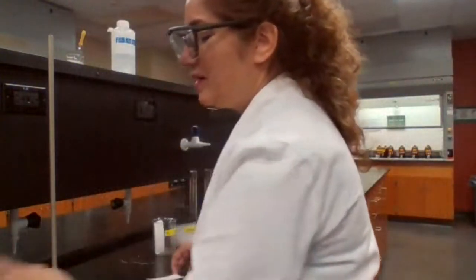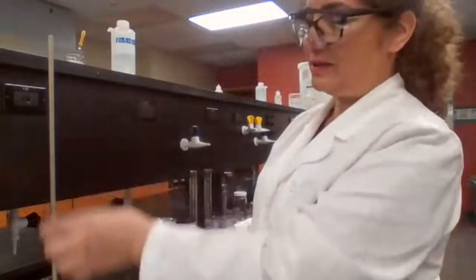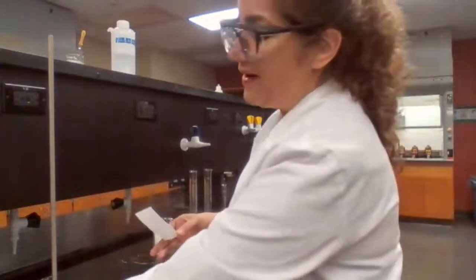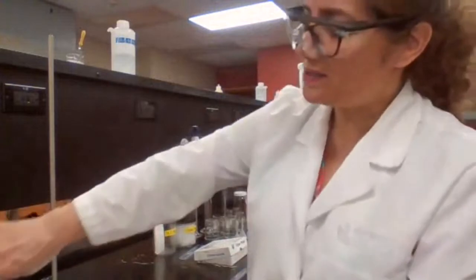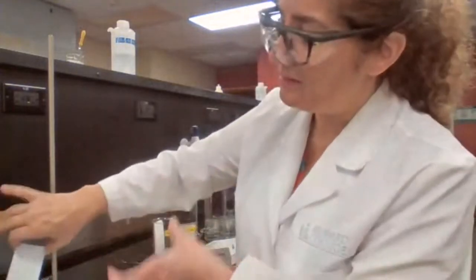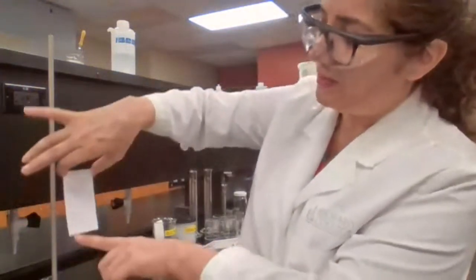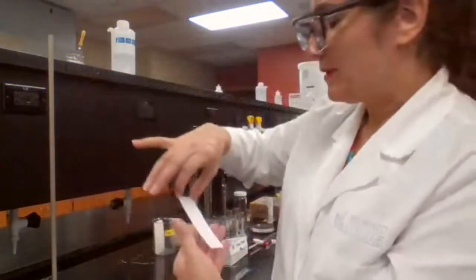If you have a wider container or a smaller container, 5 milliliters may not be the right number, but we want to make sure the solvent covers the bottom of the jar, but at the same time is lower than the level of the sample.